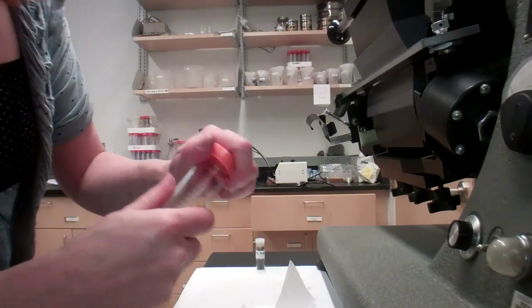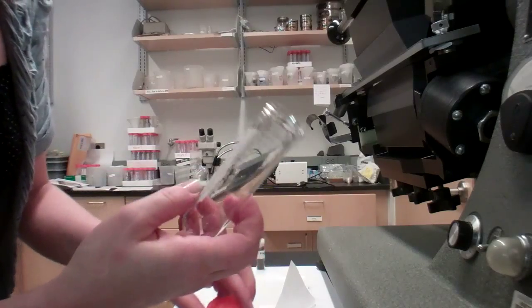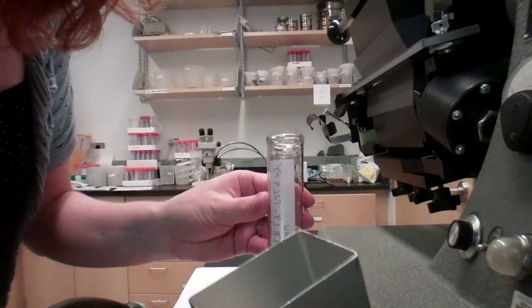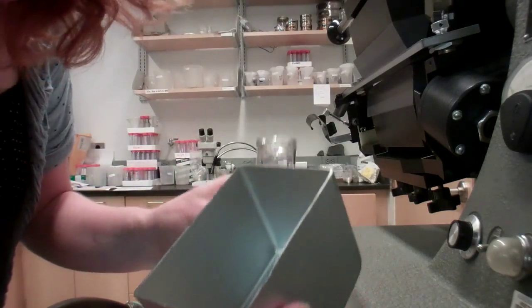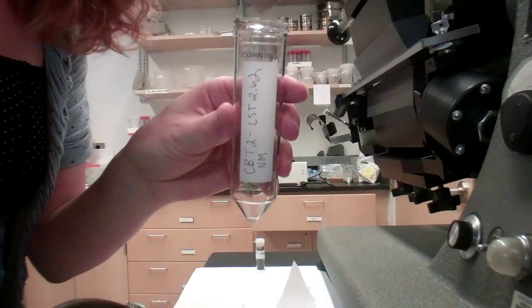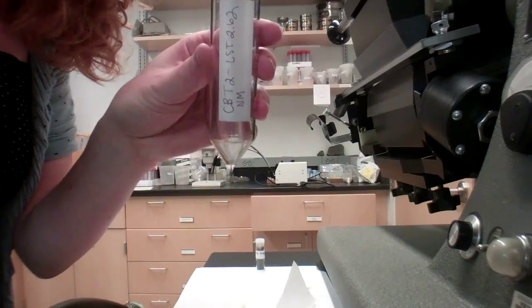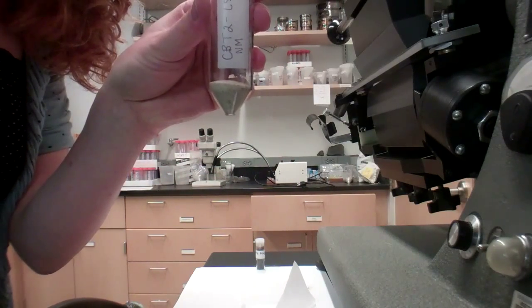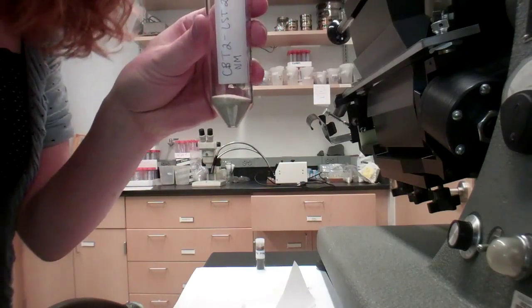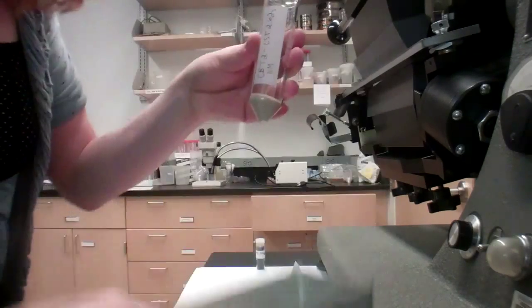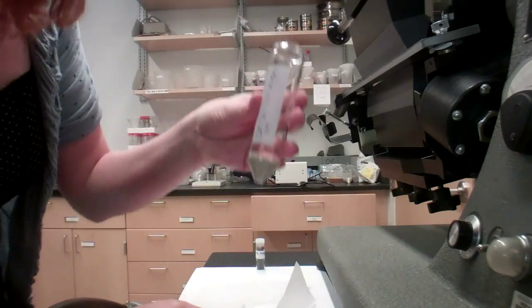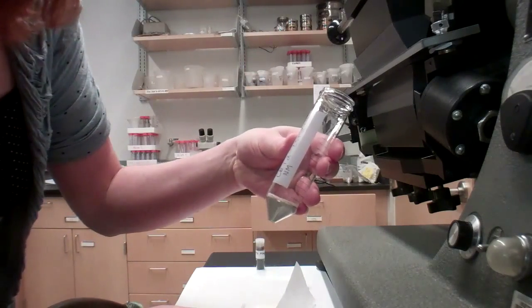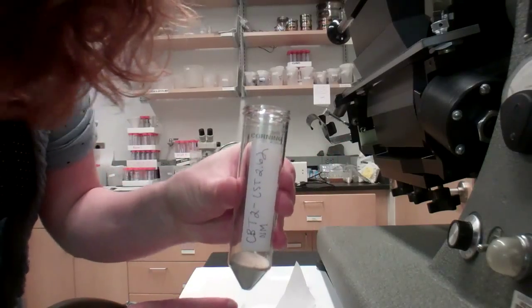Now we are going to put the non-magnetic stuff, the lighter stuff, in this. Soon we will add LST 2.62.